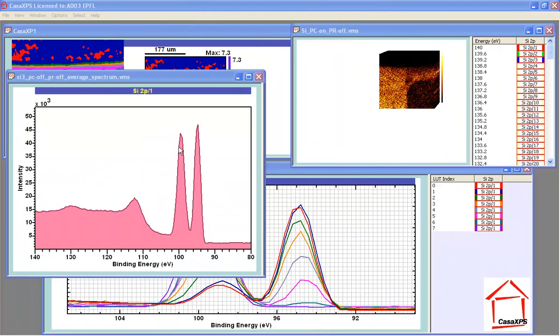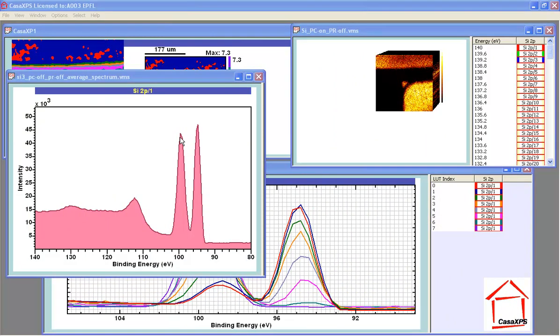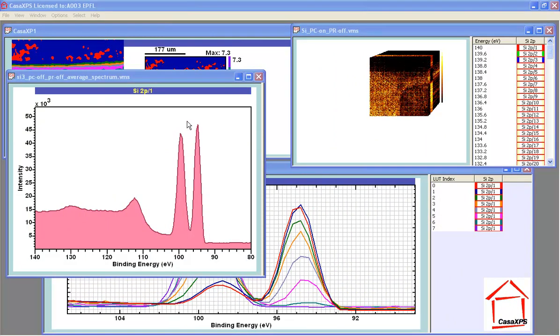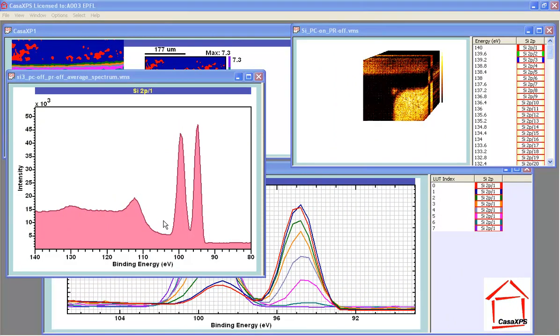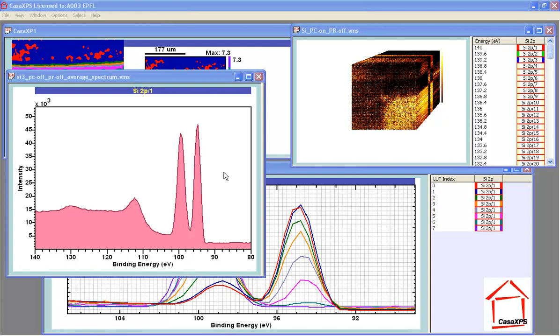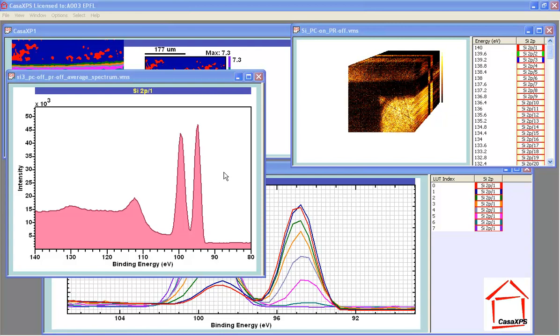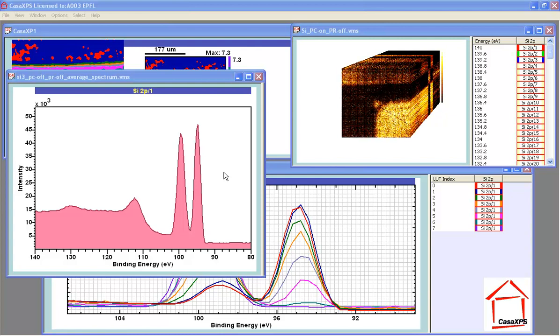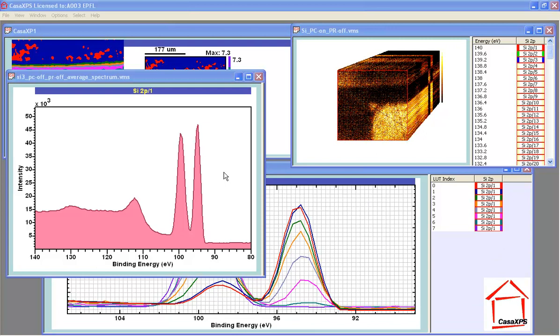The processing steps in this video are aimed at illustrating how a spectrum measured over a large area analysis is an average spectrum, and may not be truly representative of the chemistry of the sample as presented. There are pitfalls in simply doing spectroscopy on its own if we don't understand the nature of the sample we're analysing.